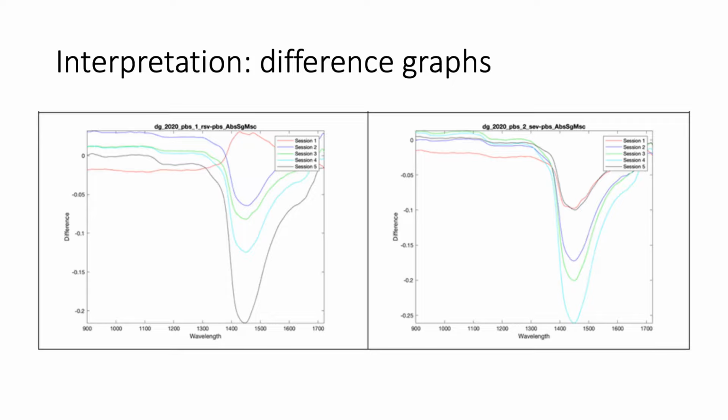The most expensive equipment is the NIR spectrometer from Ocean Optics. It cost £10,000 5 years ago, but at today's price, the whole system costs no more than £2,000.